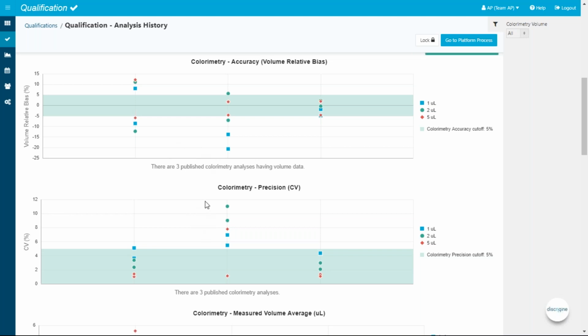So here I had to make a decision, and I just created a failure maintenance. I called the maintenance person at Agilent in this case, and I said to my colleagues, scientists, please do not use the Agilent Bravo anymore, because there is definitely something wrong with it.